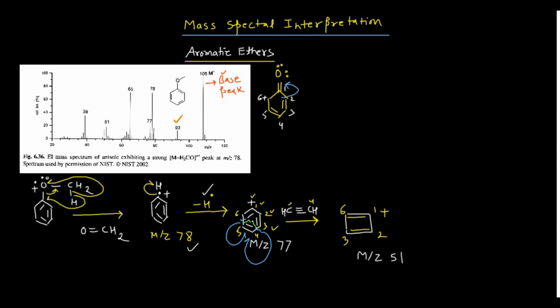And this electron pair, right? So this carbon number 2 will now make the connection with this one, so this will come here, and this electron pair will come here, and this electron pair will go there. And then I can make my new structure like that. I have removed my carbon triple bond oxygen, that is the carbonyl group. I hope you understood. Carbon double bond oxygen was already there. I have heterolytically broken this particular bond between carbon 1 and 2 and shifted the electron density over there.